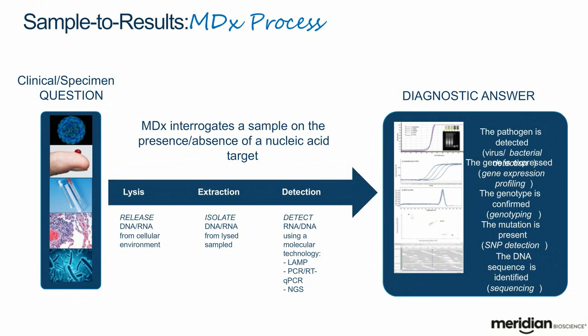This answer may be qualitative, a simple yes, no. Is this bacteria / virus there, or is the gene present, being expressed? Or it may be quantitative. How much is this gene being expressed? Or it may be that you're looking for a specific sequence, or you're looking for a mutation.